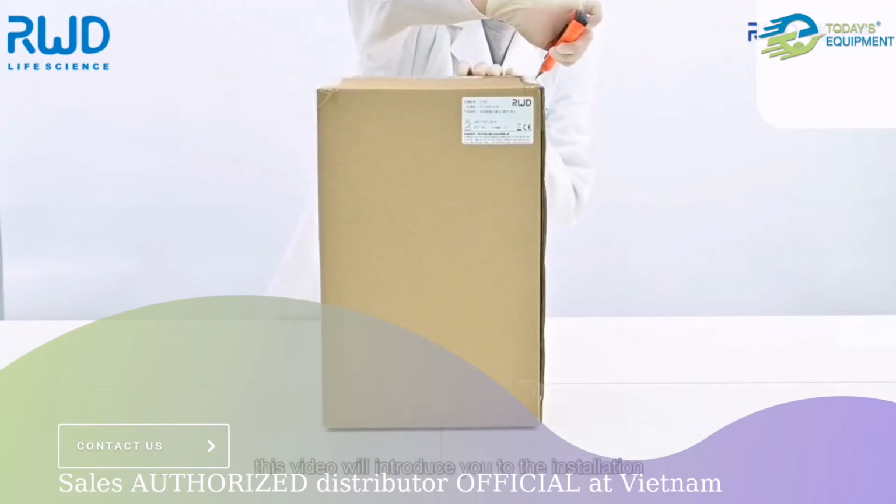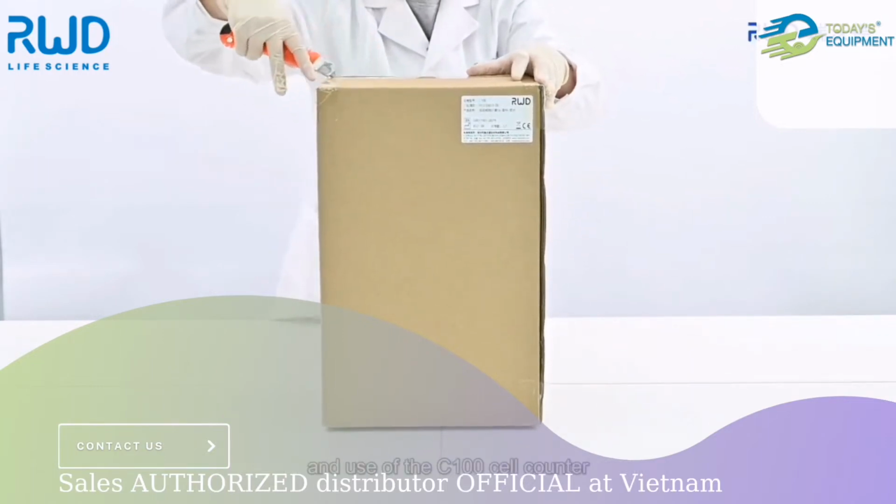This video will introduce you to the installation and use of the C100 cell counter.